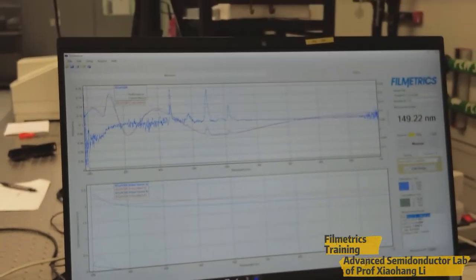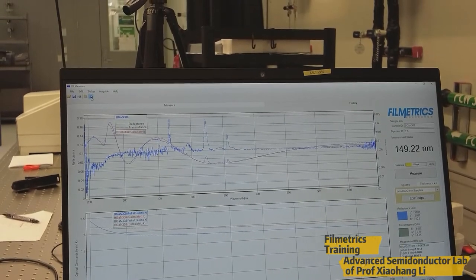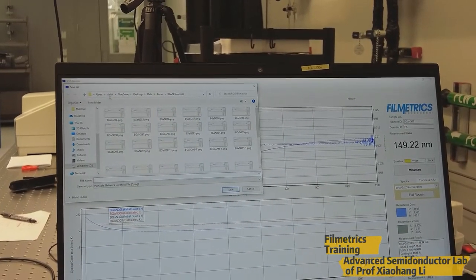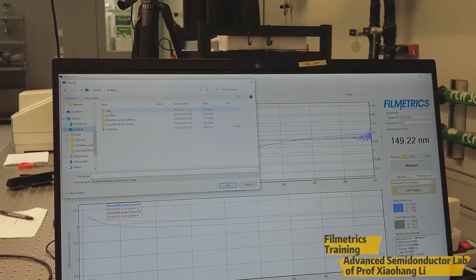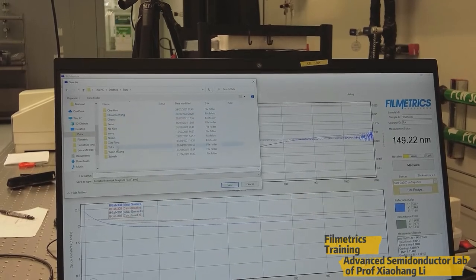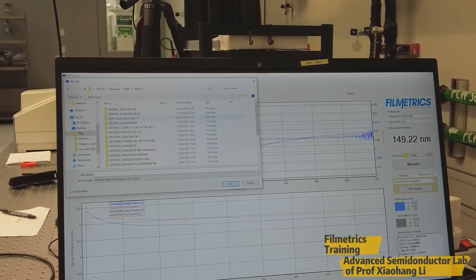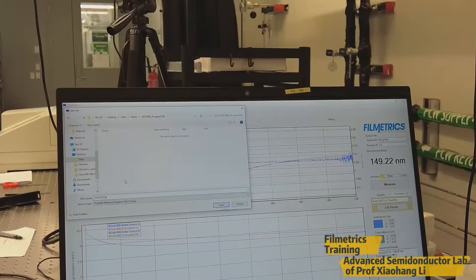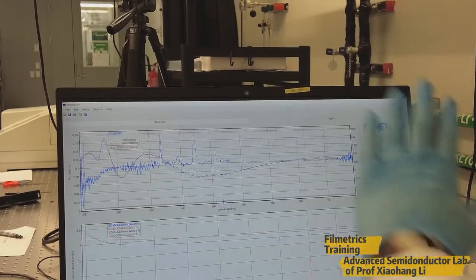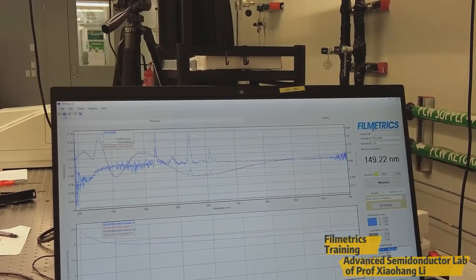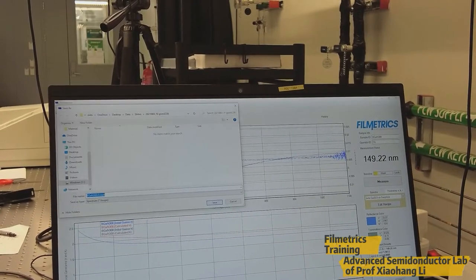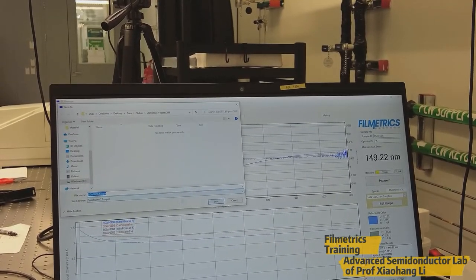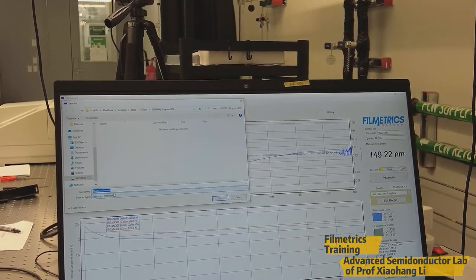Now we can save this data. First, we can save this data as an image file. So click here. So here we can save in the desktop. We have file name data where we can have different users name. I will put it in my folder and make a new folder. Okay. Now it is saved the image file. You can also save the data file from here. There is icon here, save icon here. Click this one. And type your name, name of the sample.